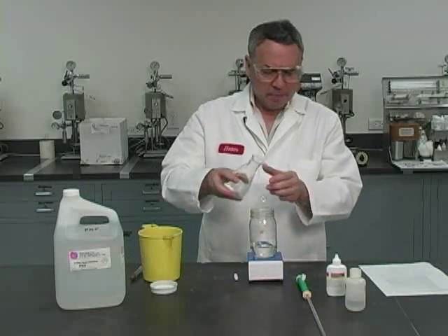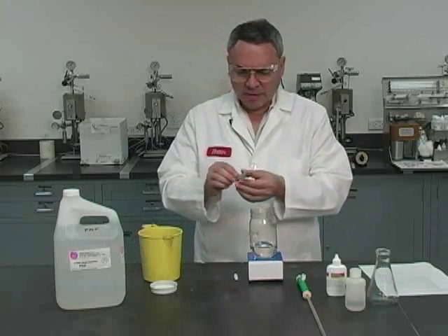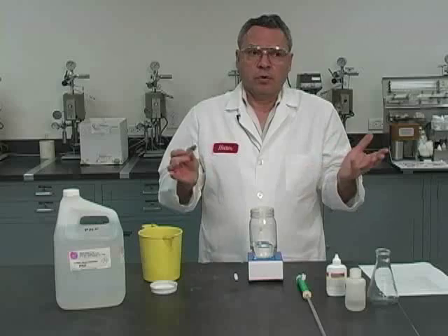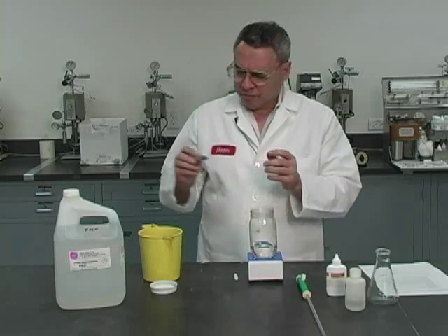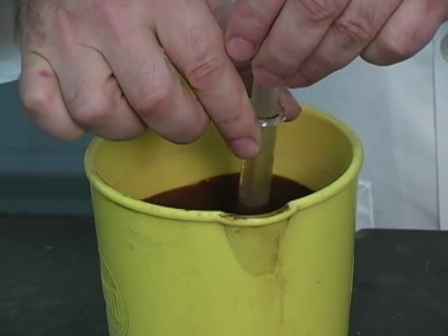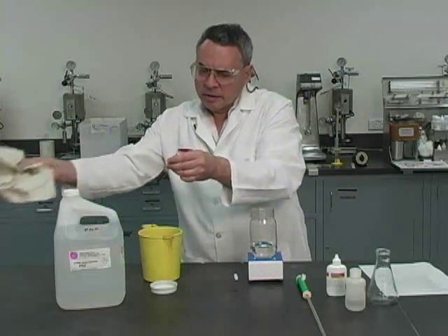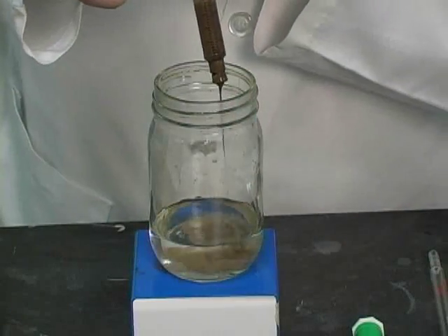And now my next step is to take a sample. So I'm going to be using a 5 cc syringe, and I need 2 cc's. That's required by the API, a standard procedure. Of course, we could go to a larger sample if we need more precision. But in this particular case, I will go all the way, for example, to, let's say, 3 or 4, in this case, 3. Wipe this a bit so I can see the reading. And then go ahead and place. I'm going to push down 2 cc's.